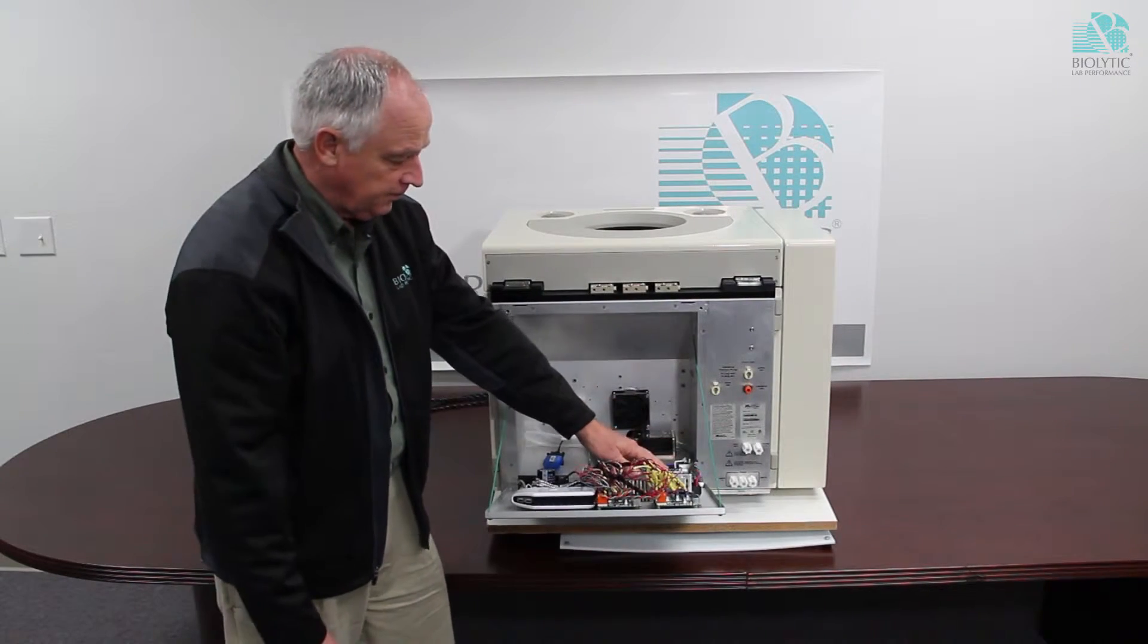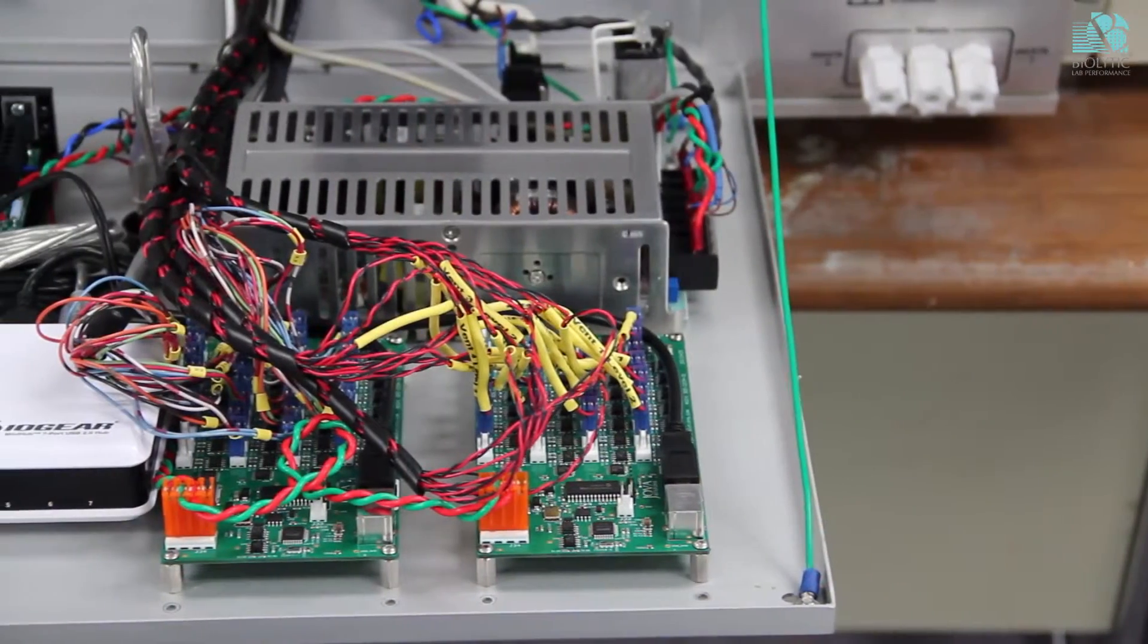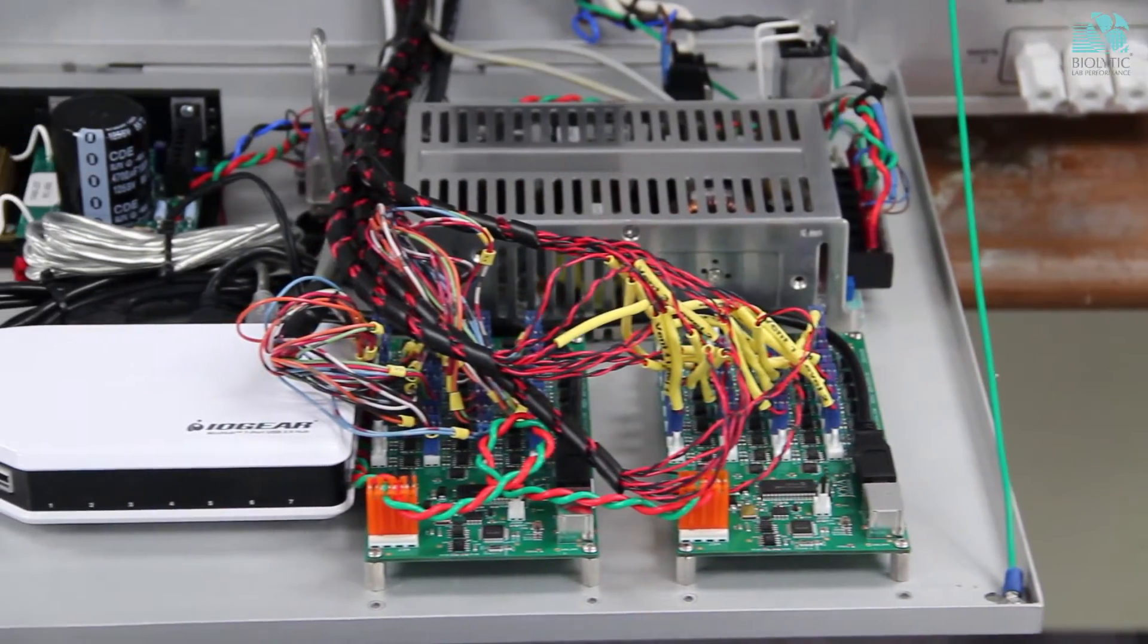It has a power supply. This power supply is used to run the valves and also used to run the motor.